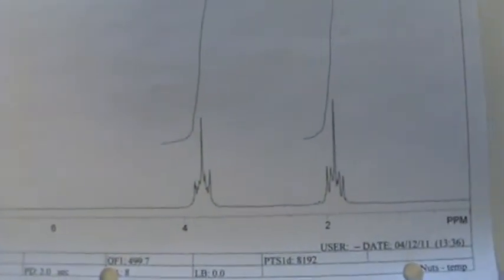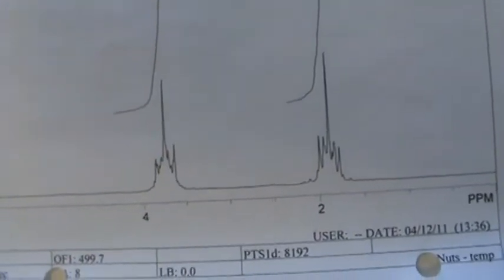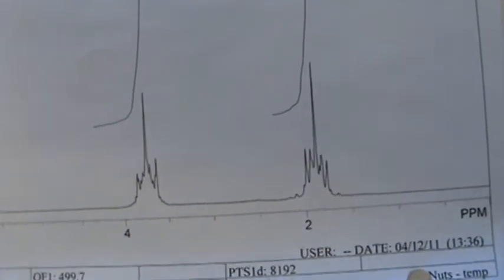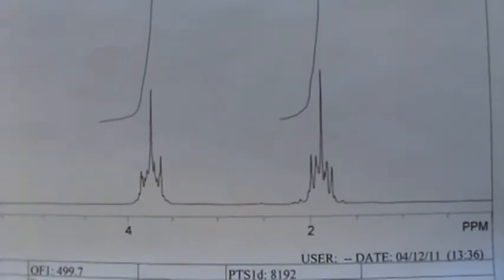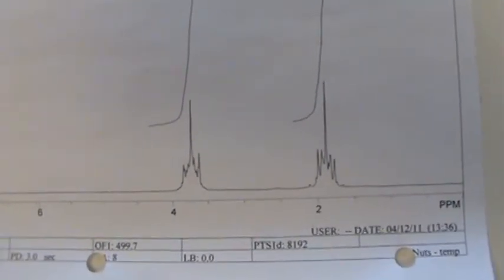Let's do some background for the proton NMR here. Obviously the solvent is THF and it looks just like that. So just in case we have leftover THF, what does the NMR look like? Because you have a ring, the hydrogens that are above the ring and below it, depending on the conformation it takes on at room temperature, you can get different absorptions. So it's not going to be pretty looking triplets. You get 2 absorptions that look like a gross multiplet, one just below 2, one around 4. So that is THF. Okay, so look for that in your final product when we get there.